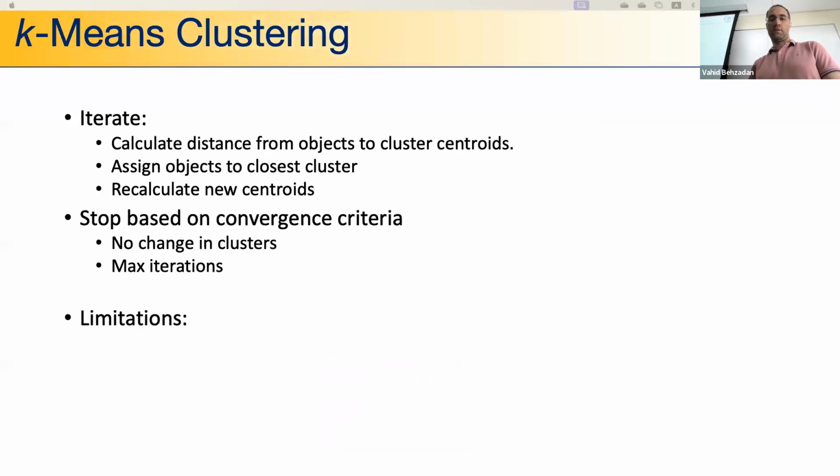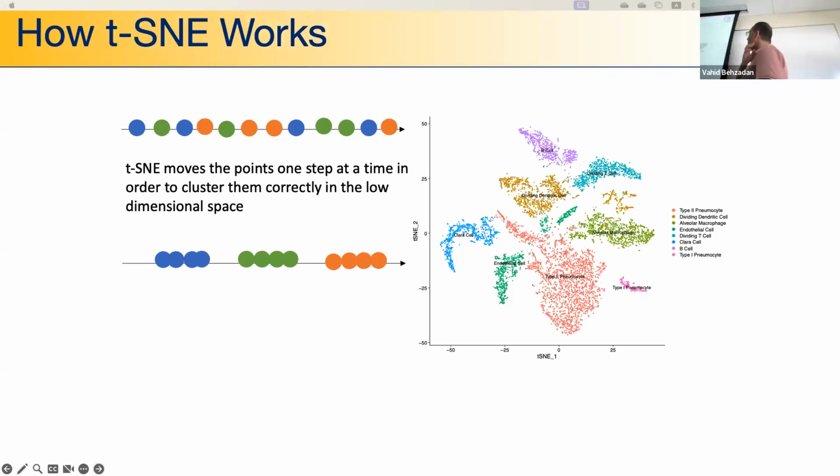Sorry for that. What is it? Let me go back to this one, right? So here you have red cells that are similar to the green cells, right? But I also see a lot of red cells that are all over. Yeah, because these cells, if you see the type, it's called type 2 pneumocyte, and this sample is from the lung.